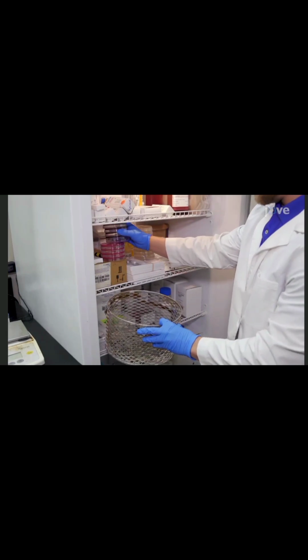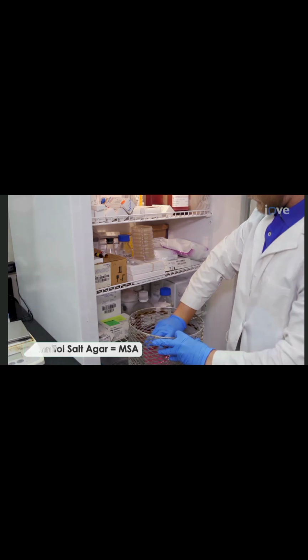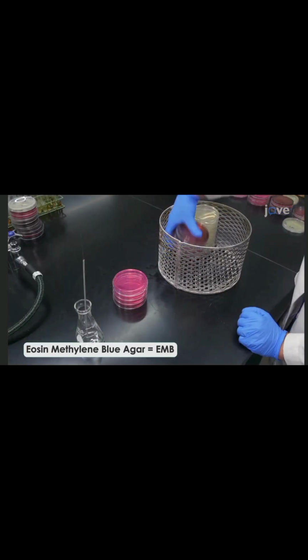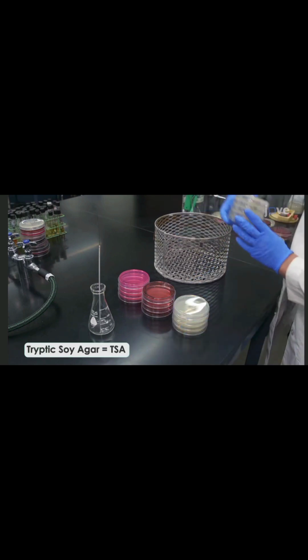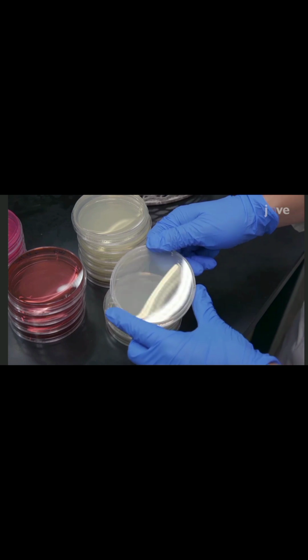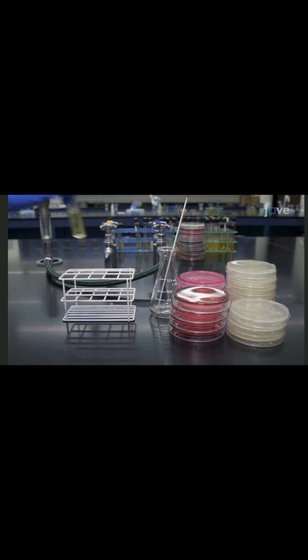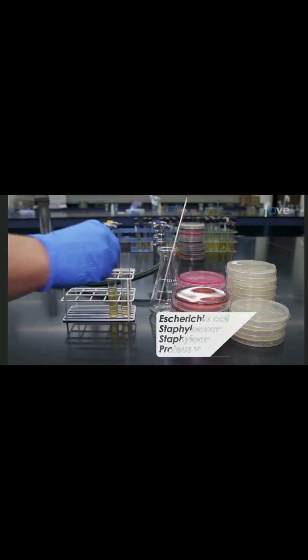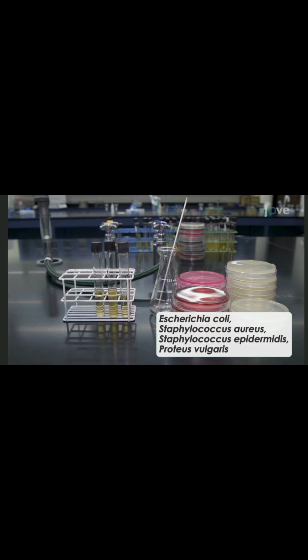Then, from the refrigerator, gather 4 plates of mannitol salt agar, or MSA, 4 plates of eosin methylene blue agar, EMB, and 8 tryptic soy agar, or TSA plates. TSA medium is a non-selective growth medium which will be used for the 2 different environmental conditions. Finally, gather your cultures of interest in a tube rack. Here, Escherichia coli, Staphylococcus aureus, Staphylococcus epidermidis, and Proteus vulgaris will be grown.